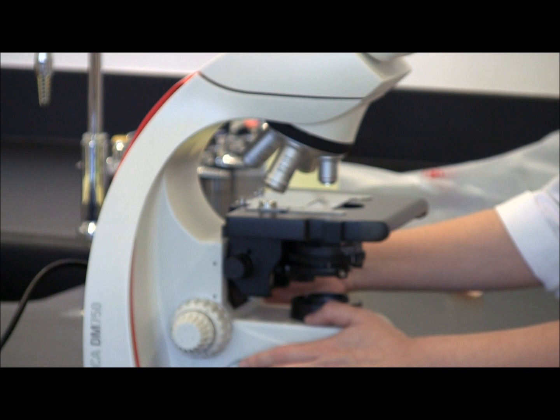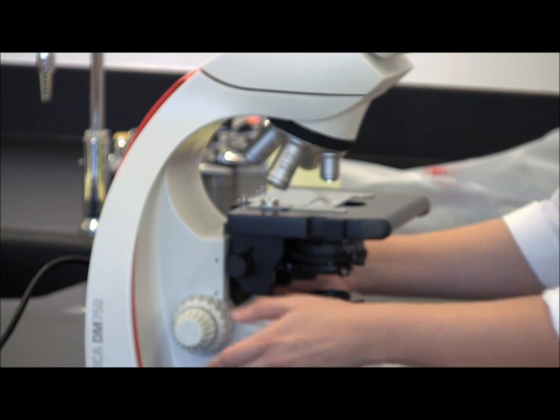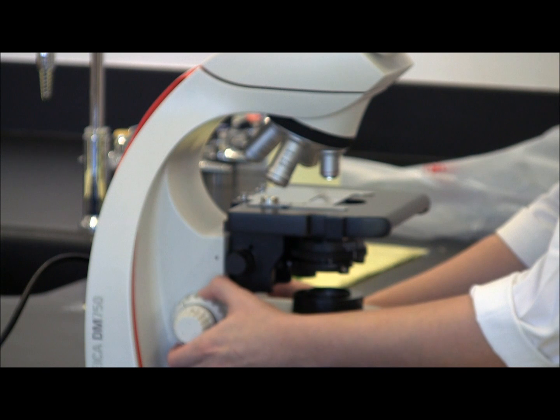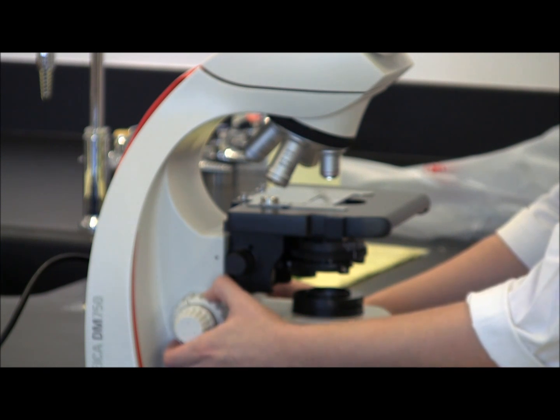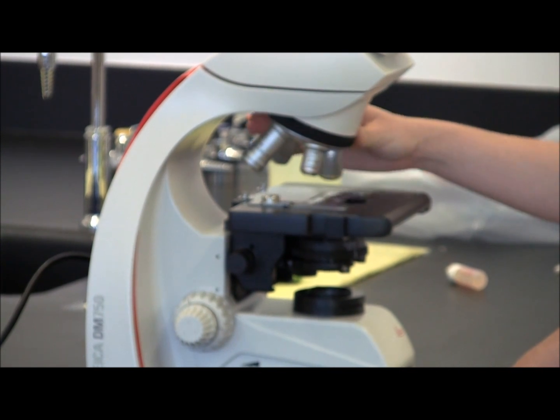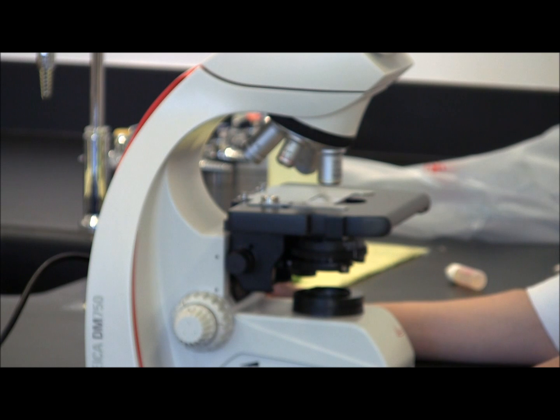And then while looking through the eyepiece, move the stage downward using the coarse focus knob until you see your specimen come into focus. This shouldn't take very long. So now that I have that in focus, we're going to switch to the 10x objective. Here, using the coarse focus knob, you can adjust the focus so that it's even crisper on this objective. It shouldn't take very much movement.